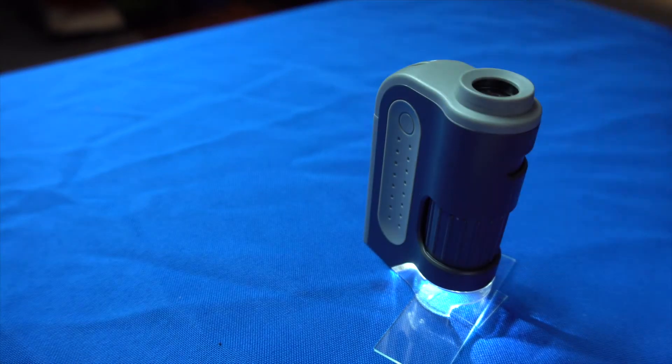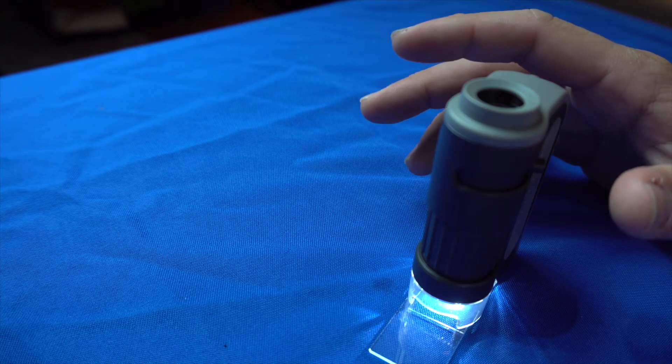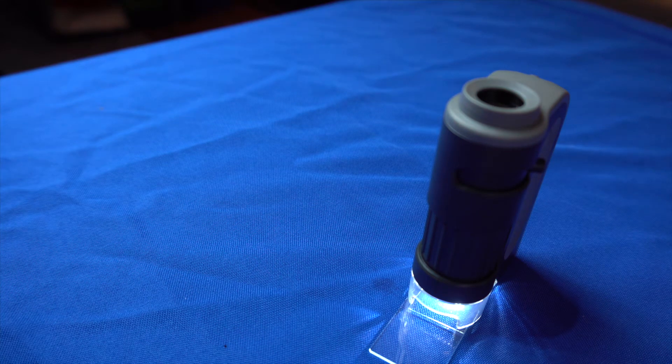Through the microscope, this is what you're going to see. What you see there is just a little bit of particulate — it's not actually any type of bacteria. There's just some threads that got caught. So as you can tell this fecal exam is okay. Rule of thumb for medicating your animals: if there are more ova than you can count in one view of the slide, your animals should be medicated. If you can count them easily and they are very sparsely placed all over the slide, there is no need to medicate.